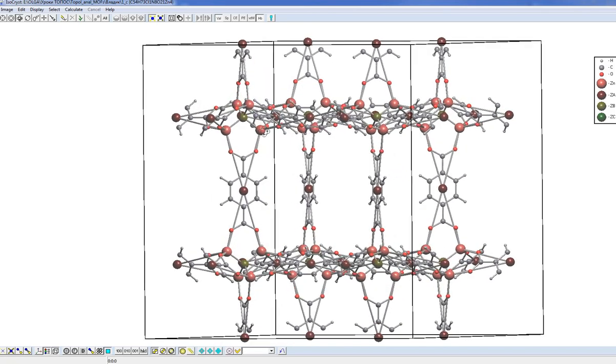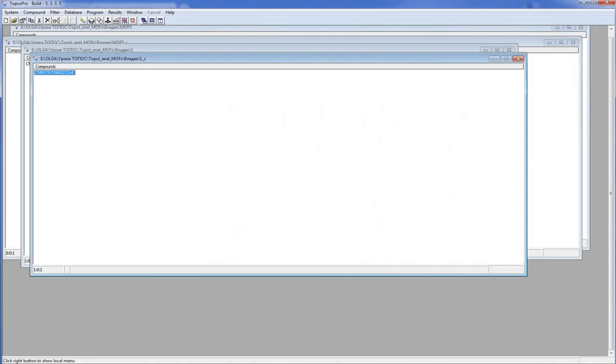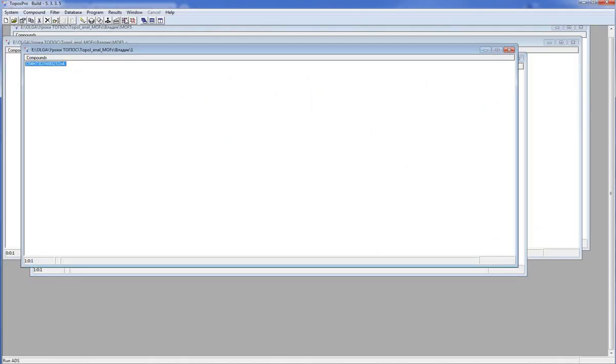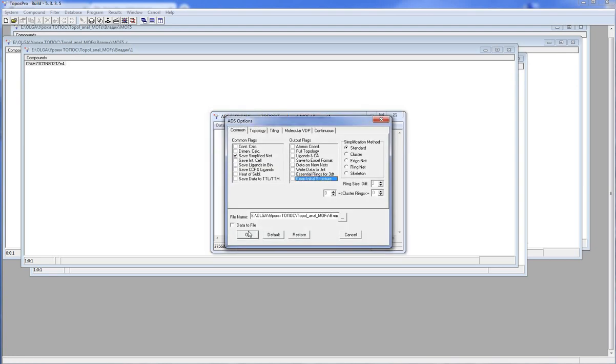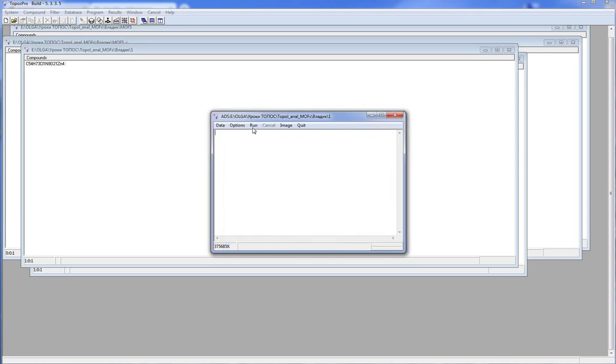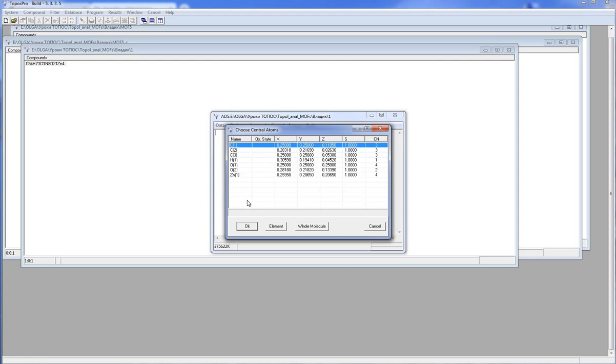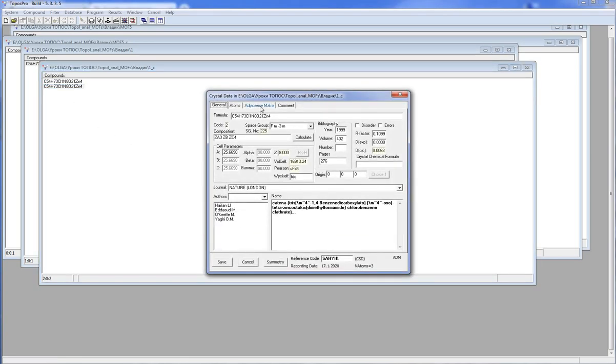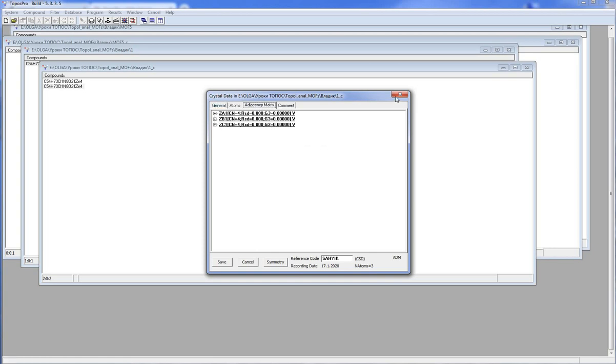As you can see the ZA pseudoatom coincides with the center of mass of the benzene decarboxylate, ZB and ZC with oxygen and zinc atoms respectively. I make the simplification again to obtain the underlying net only, so I uncheck the keep initial structure option. Now I have simplified centers only and I can determine the topology of the underlying net.